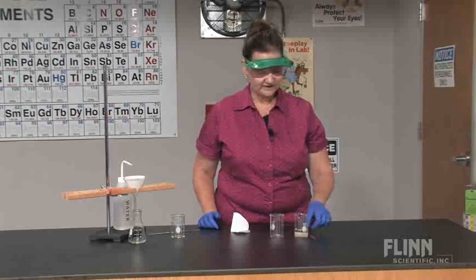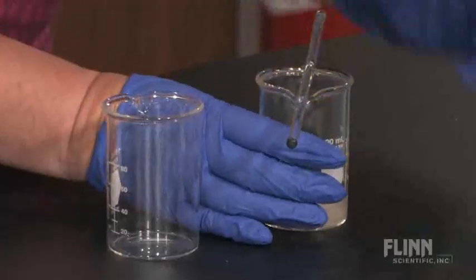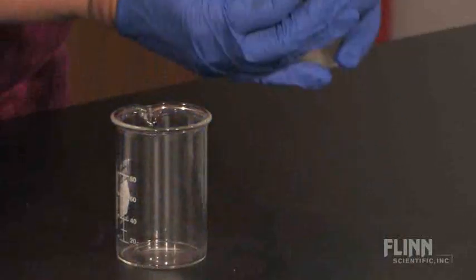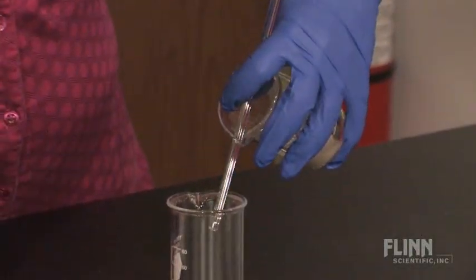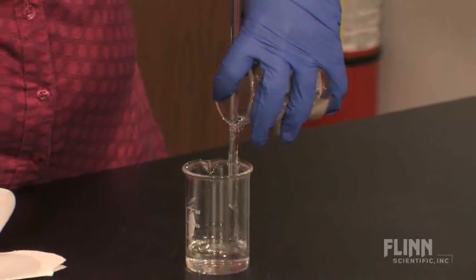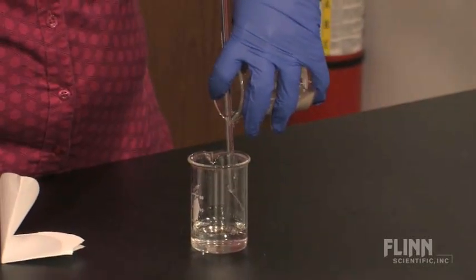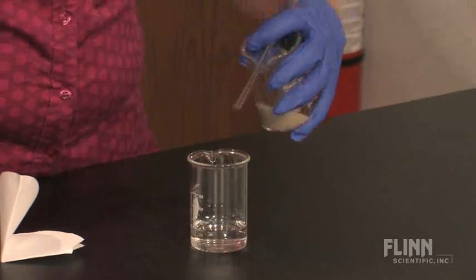In this case, you want the solid to settle to the bottom of the beaker. Again, putting the stirring rod over the top to guide the flow of liquid, and holding it in place, you simply pour off the top layer of liquid into another container, so none of the solid gets transferred. You may need to leave some of the liquid in the beaker.